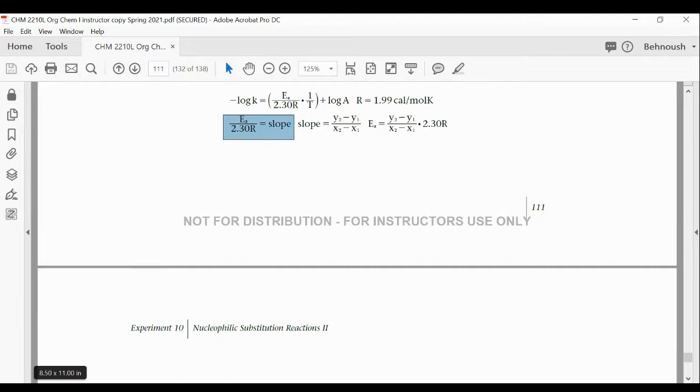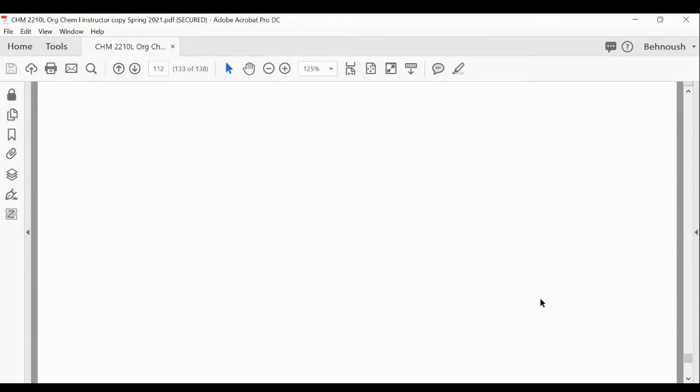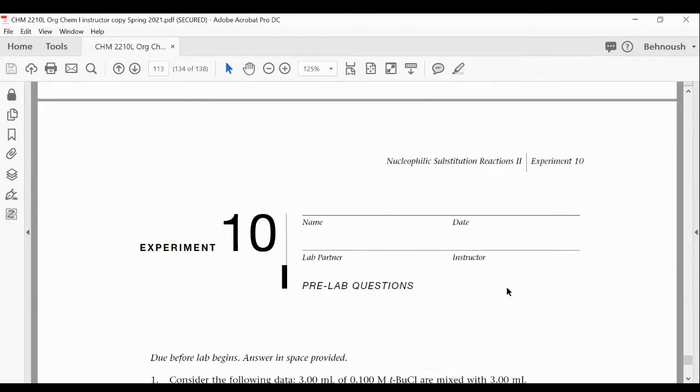Yes, the graph is just for the temperature portion. Just for the 3 temperatures, and the K value for the 3 temperatures, just one graph only. The other one, you could just compare the time. How long does it take?